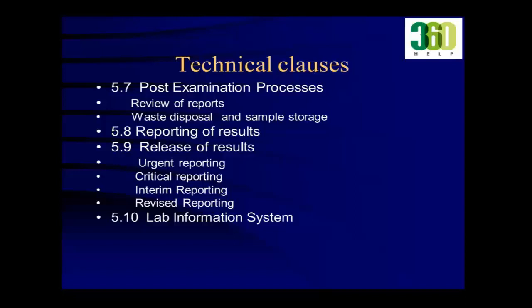Then comes 5.7, which is a post-examination process: after the result is generated, how will you report, how the doctor looks at or makes the report and delivers it. Waste disposal, again a very important chapter. Sample storage, you all know that in histopathology, storage of samples, storage of blocks, storage of slides is again very, very important.